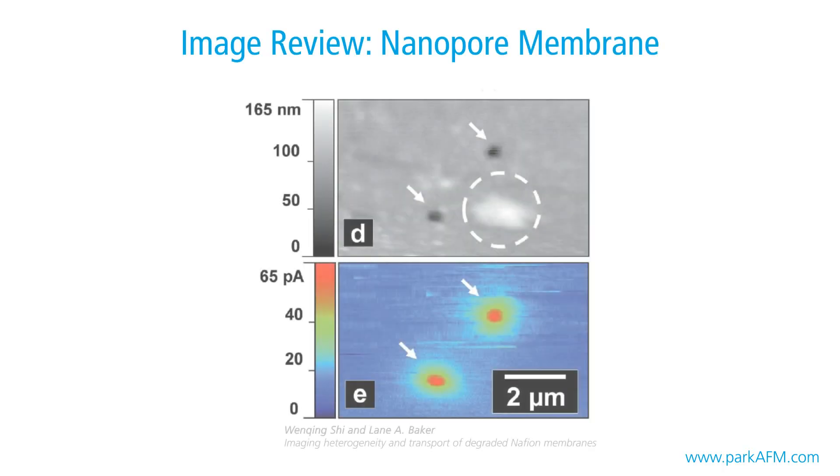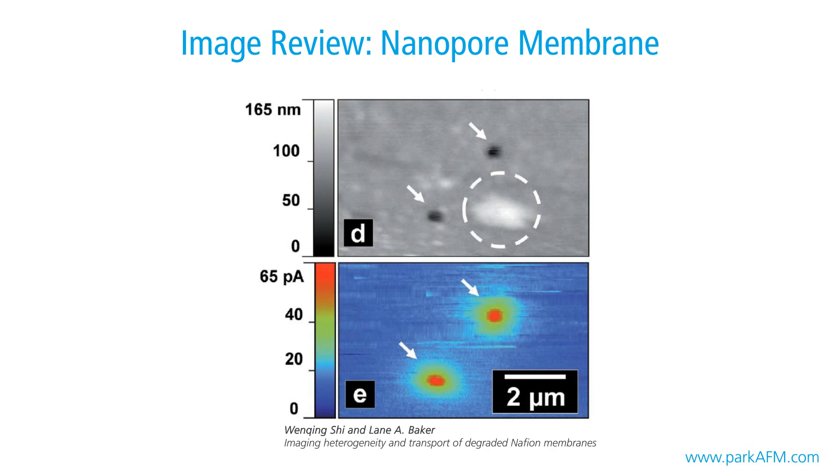Again, SICM isn't just for biomaterials like collagen. It's extremely helpful for many types of nanoscale research of samples under in-liquid electrolyte conditions. Here is a pair of finished SICM and SECM images. Taken with the same nanopipette, these images together confirm the size and Faraday current responses of nanopores in the membrane designed for next generation fuel cells.